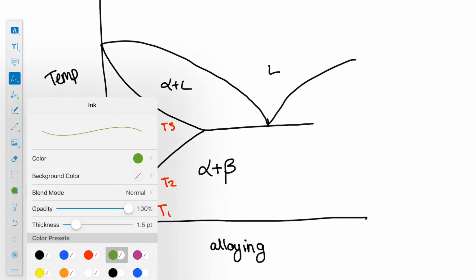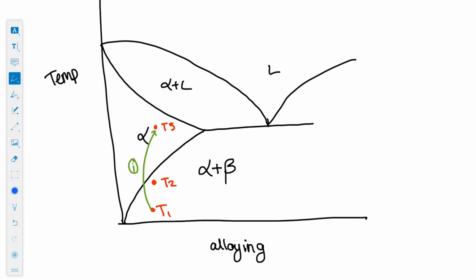So in the preparation of the samples, I did this by taking my untreated samples and throwing them in the oven at around 525 degrees Celsius and holding them there for an hour. So the goal of this was to dissolve my beta phase.